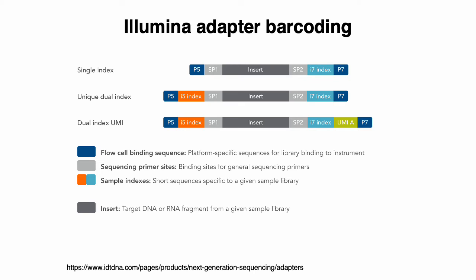When you add these I5 and I7 indices to each sample during your adapter ligation, you're giving a unique I5 and I7 pair to each sample so that each one uniquely identifies each sample. And that allows you to make sure that even if index hopping happens, you can identify it because you'll have mismatched I5 and I7 indices.